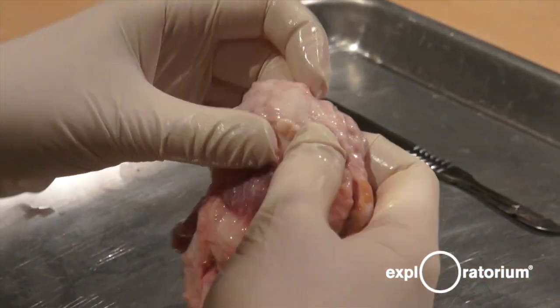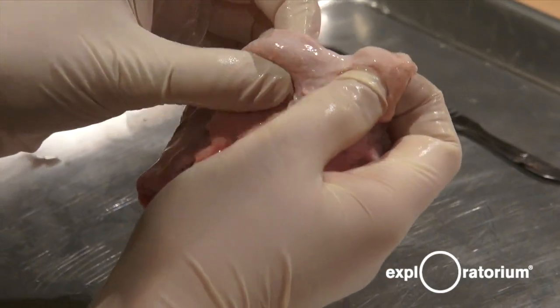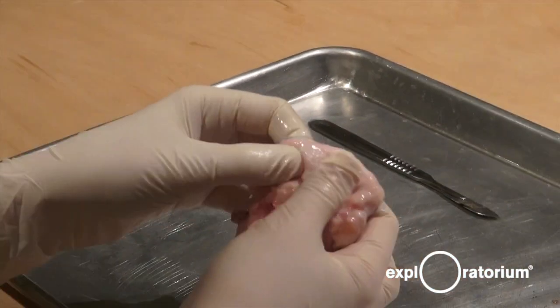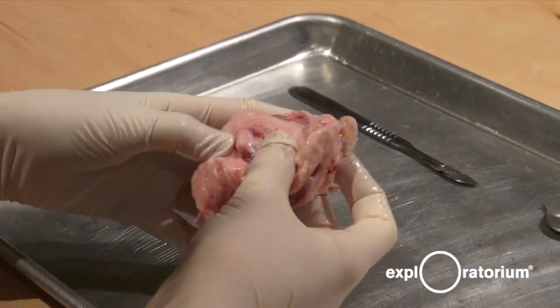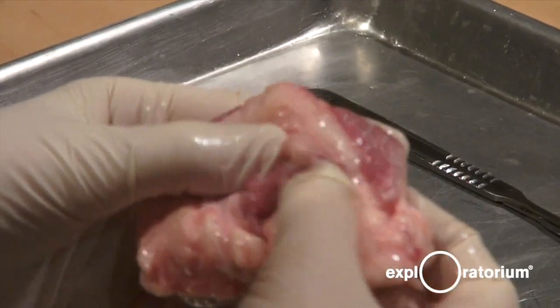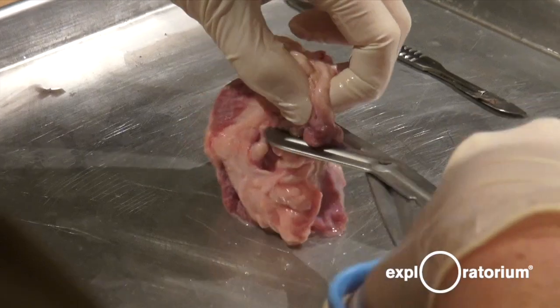We also have fat tissue around our eyeball — this whitish pink stuff right here. And this acts as cushioning, because our eyeballs sit in our skull, and our skull is a very hard bone, so we need some cushioning to make sure our eye doesn't get damaged. We can also see the optic nerve, which is this right here, and this is connected to the brain. I'm going to cut off all the fat and muscles so we can see the eyeball a bit better.